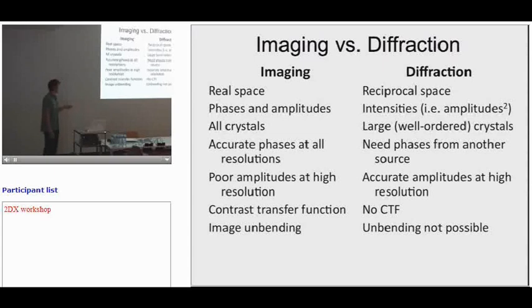And the last thing is that there's no unbending. So whatever the resolution that you see in your diffraction pattern, that's what you get. Whereas with 2DX and MRC, you can actually start to improve the resolution by unbending your crystal.